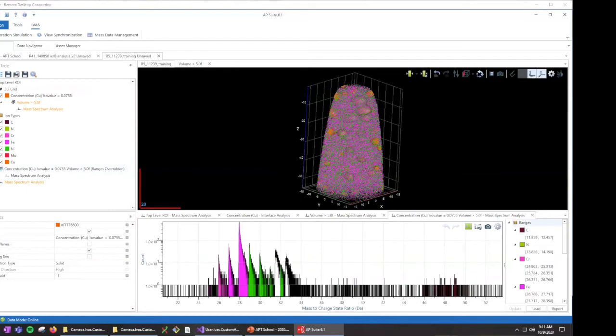All right, here we go. So let me go back here. First question is from Marcus. What is the volume of an arbitrary isosurface here when there's no guarantee that the surface is watertight?